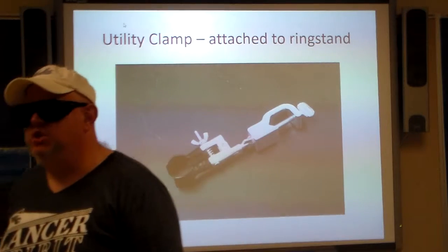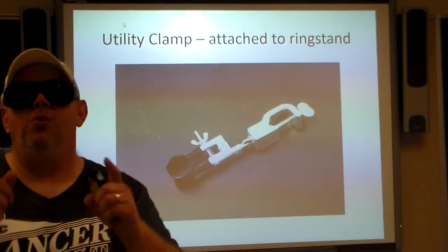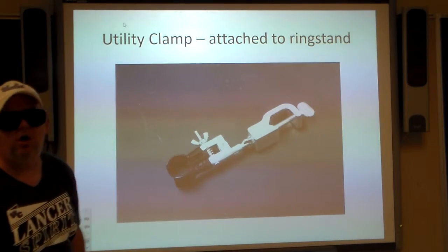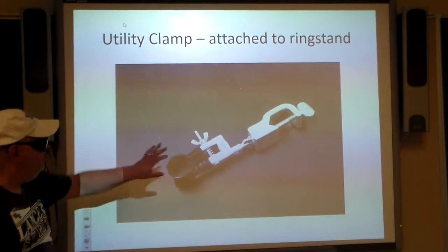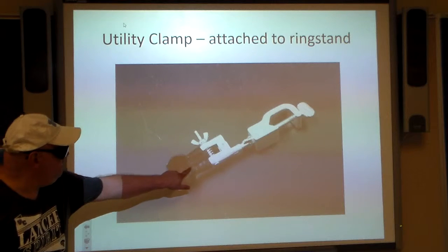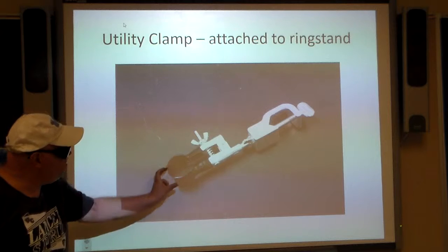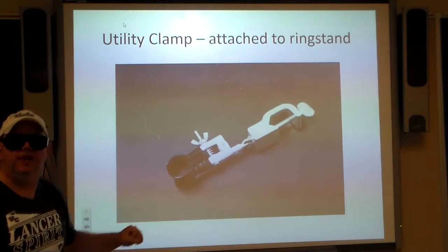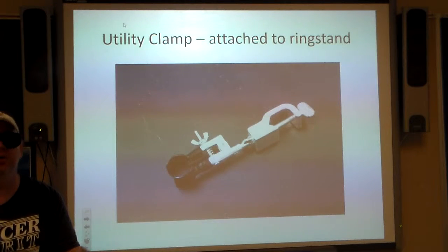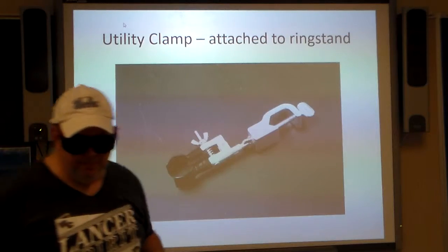Utility clamp — you might think this belongs on Batman's utility belt because it's called a utility clamp, but no. We attach this to something called a ring stand. With it we can attach all kinds of things. There's a little wing nut here you can twist closed and it will clamp onto something. Look at the round shape — that might give you a clue as to what it clamps.